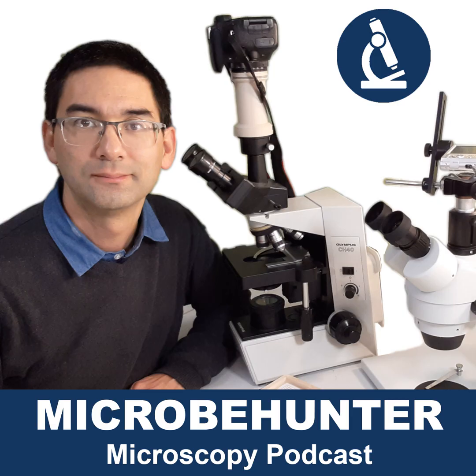I assumed that you want to buy a microscope not because you have a specific research goal, but because you're interested in using it for amateur reasons, to complement your university studies. For this reason, I would say you want to stay general purpose, and therefore go with a decent, good bright field microscope.